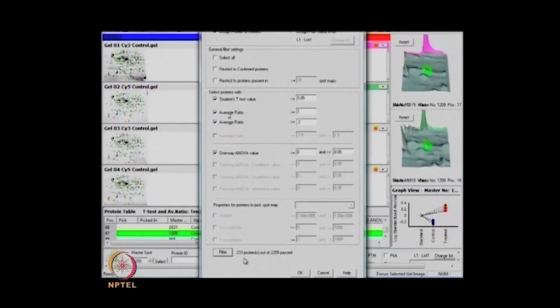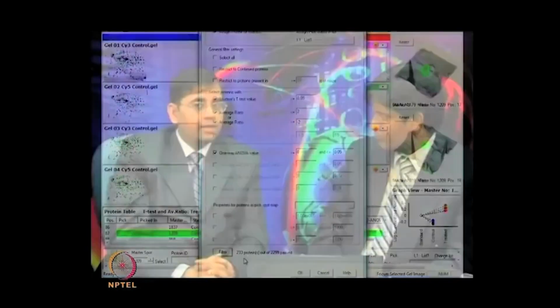So, can you elaborate on what EDA or extended data analysis is, what it can do, which we are unable to do in BVA? So, there are layers here, right? One is DIA followed by BVA, and then ultimately EDA analysis. Exactly. Basically, what we can do here is compare two BVAs together. Here we are talking about a particular disease or particular set of data only. In EDA we can analyze different BVAs together. There you will get majorly differential expression, as well as PCA and discriminant analysis. These kinds of statistical data you will get in EDA.